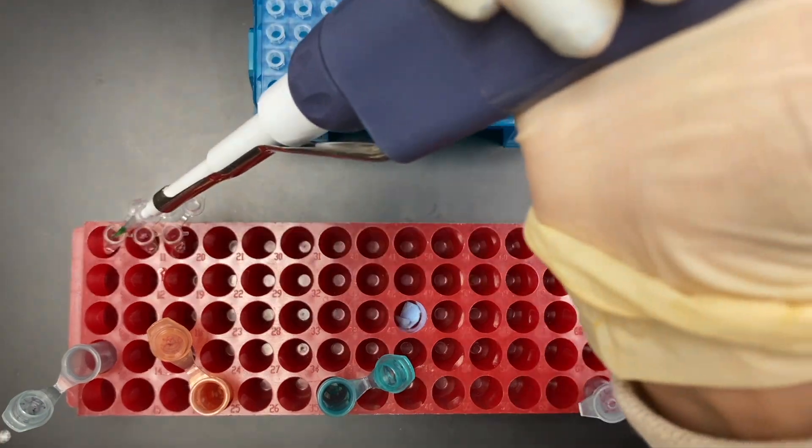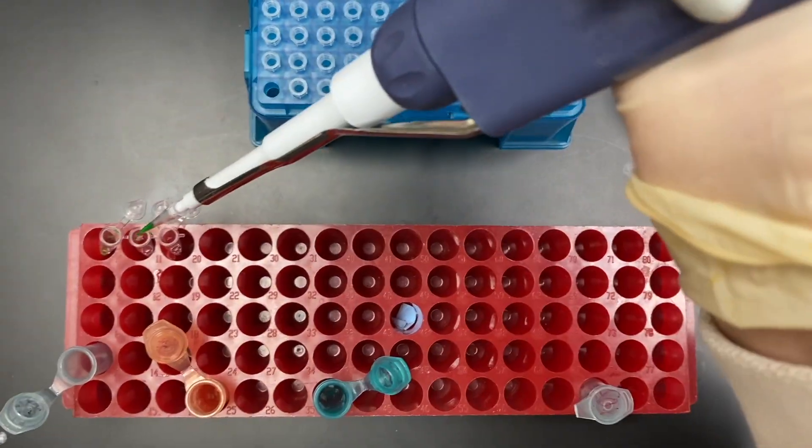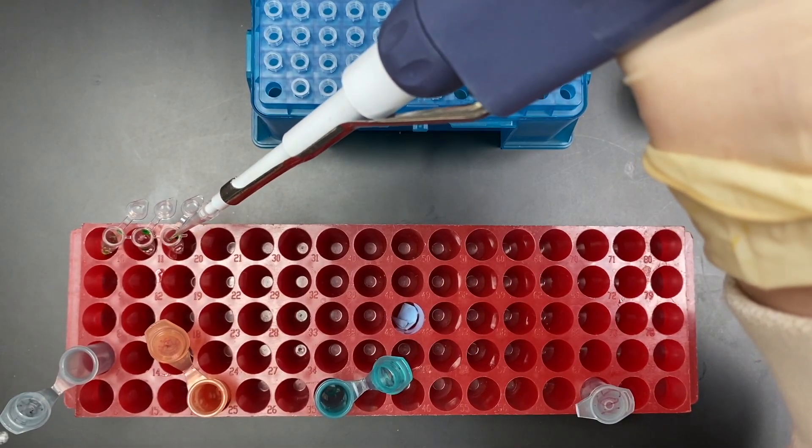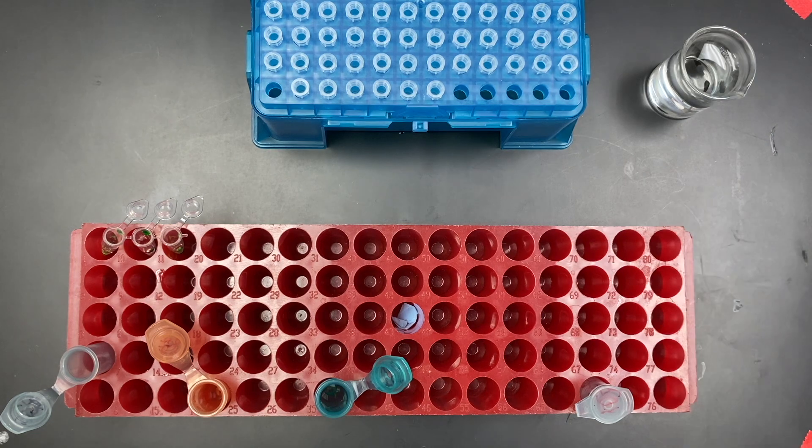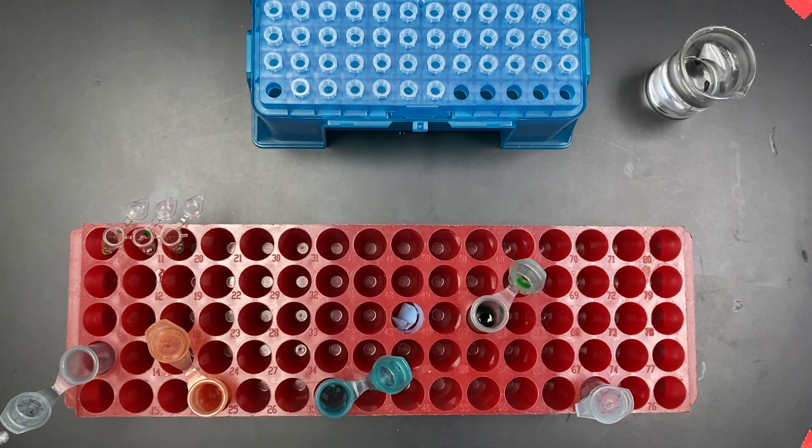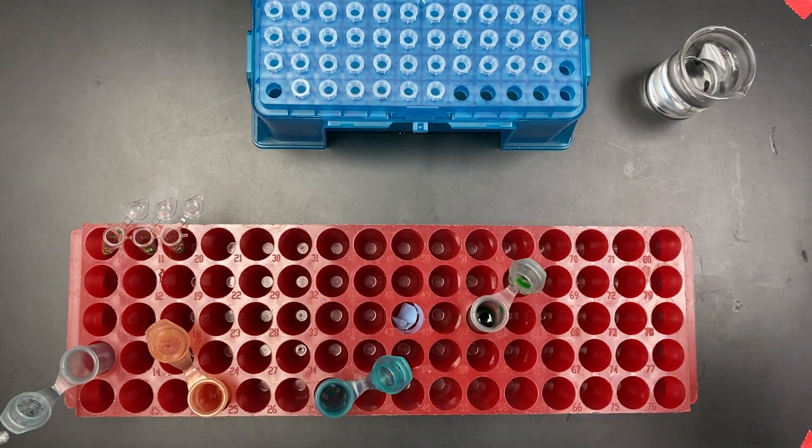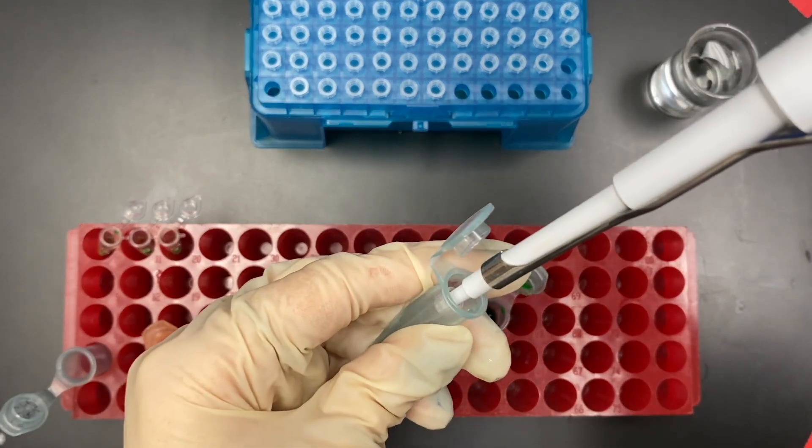I then add 6 microliters of the master mix, which is just a pre-mixed solution of products the DNA will need in order to self-replicate, such as DNA polymerase, magnesium chloride, and some more buffers. And finally, I add 1 microliter of the extracted DNA to each sample.